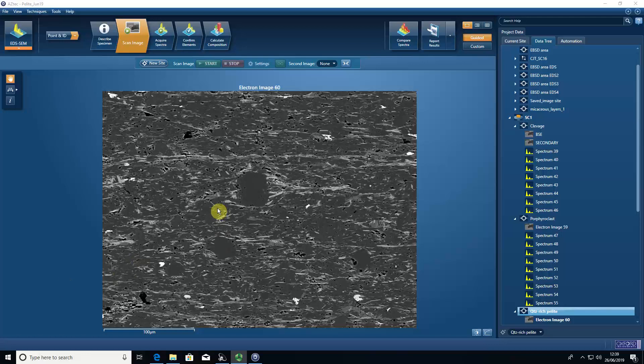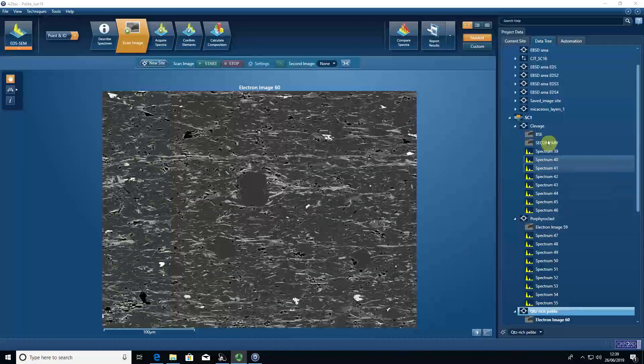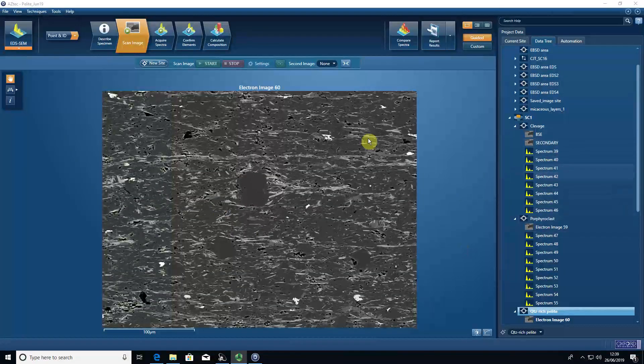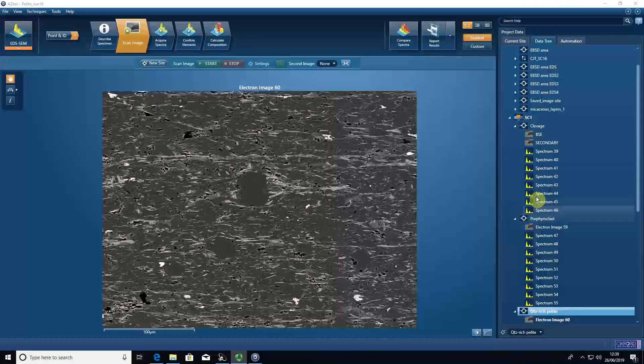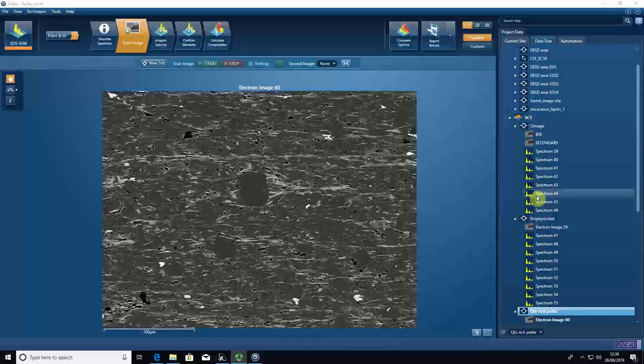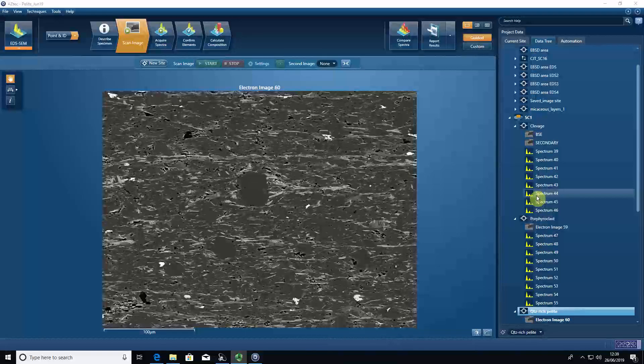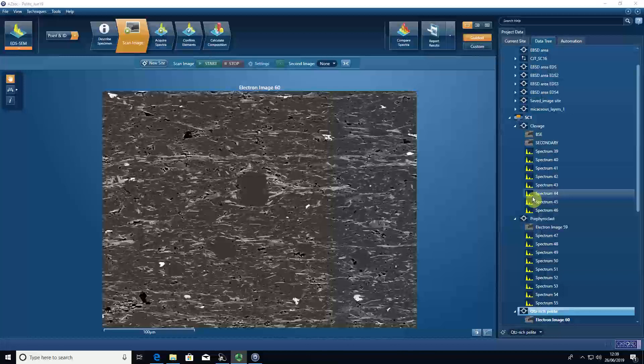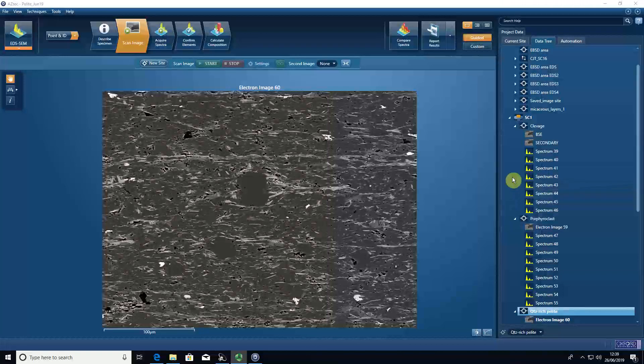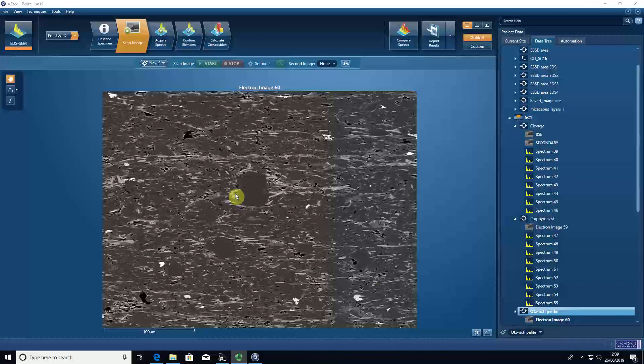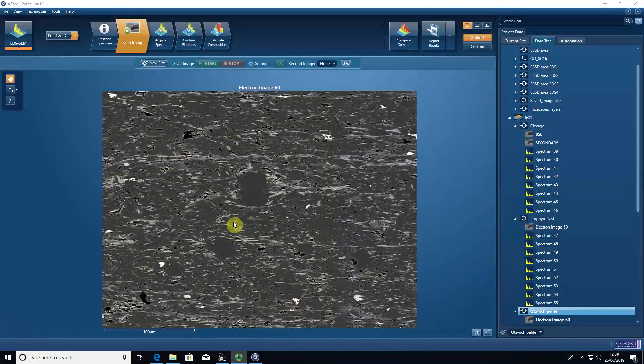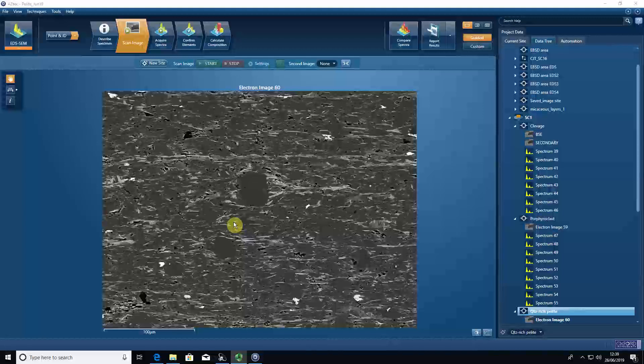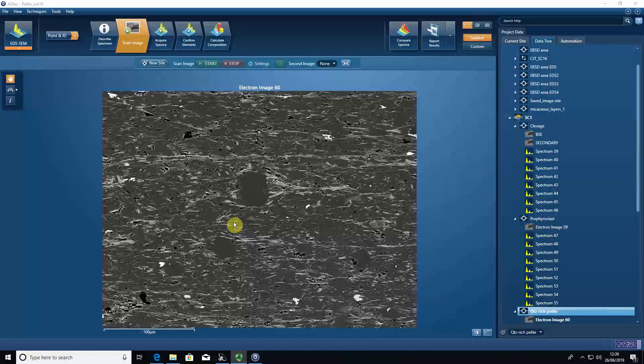When we have image and spectral data, which you can see here in Aztec, some people like to export all of their data into a Word document which summarizes what the image looks like, where the spectral locations were, and what the actual chemistry of the spectra are.